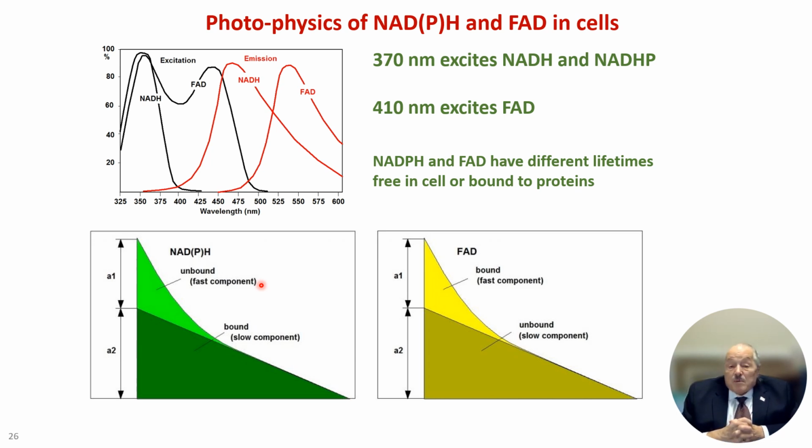I think this experiment was quite complicated, but it was based on the different photophysics that NADH and FAD have when they're bound to a protein. NADH can be excited at 350 and it emits out at 450 or so. So we have that laser, and the FAD can be excited at 410.